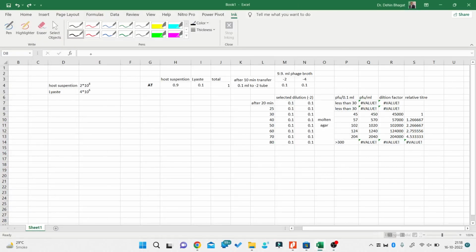Hello students. In this video I will explain the methodology of the one-step growth curve for the bacteriophage and the calculation of that. I hope this will be helpful for you.